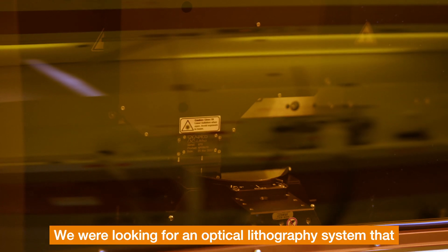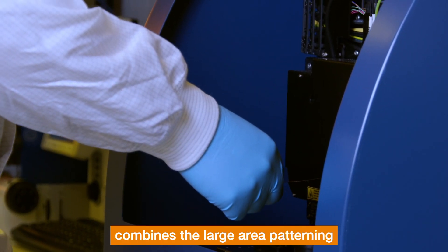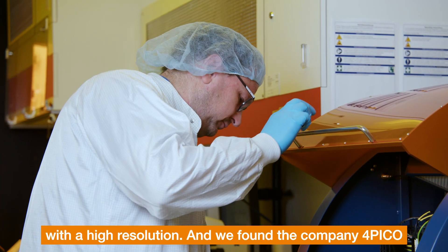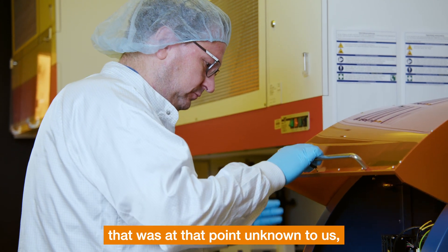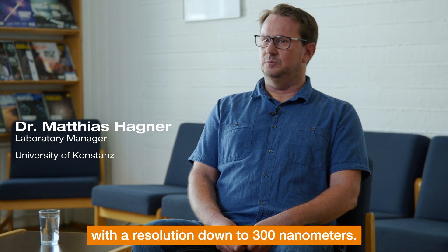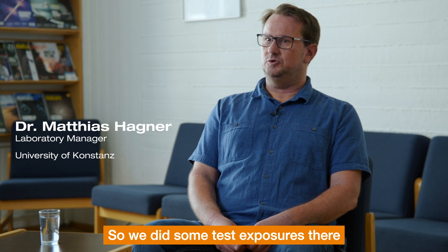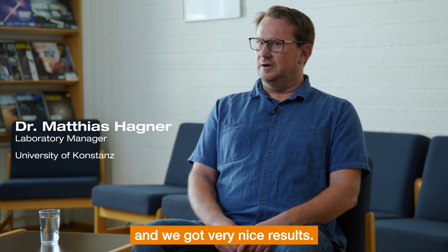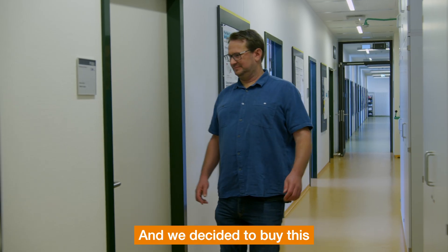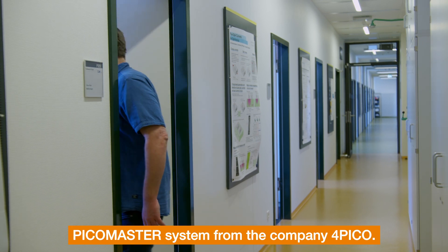We were looking for an optical lithography system that combines large area patterning with high resolution, and we found the company Pico — which was unknown to us at that point — providing a laser lithography system with a resolution down to 300 nanometers. We did some test exposures, got very nice results, and decided to buy the PicoMaster system.